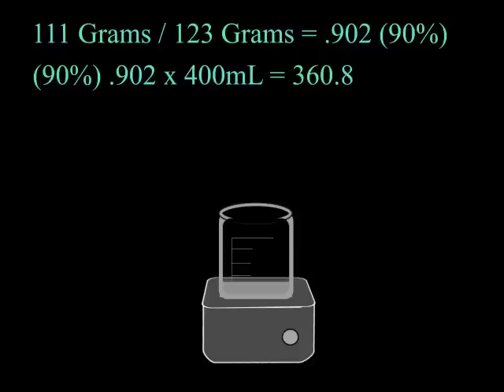Then decant off the liquid. You will lose 1/3 of the yield to the acetate unless you evaporate it off to dry, then you can recover the remaining product. Use this method only if you need some product immediately. Take your samples after they are dry completely and container them for future use.